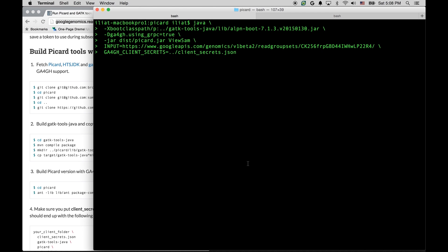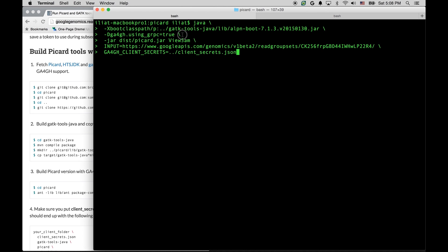The command line is almost the same, but you need to add an ALPN jar to the classpath. That's here. And we have instructions on which file to use, depending on whether you have Java 7 or Java 8. In this case, I'm using the file for Java 7. We also need to tell our implementations that we are going to be using gRPC. And other than that, the command line looks the same.